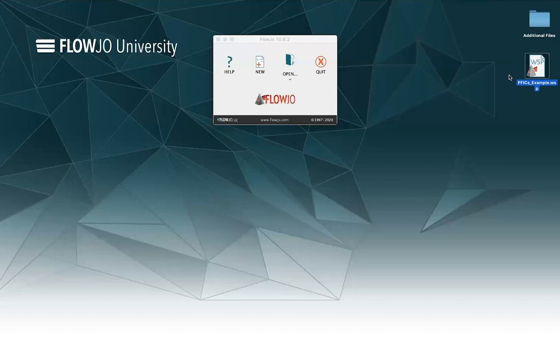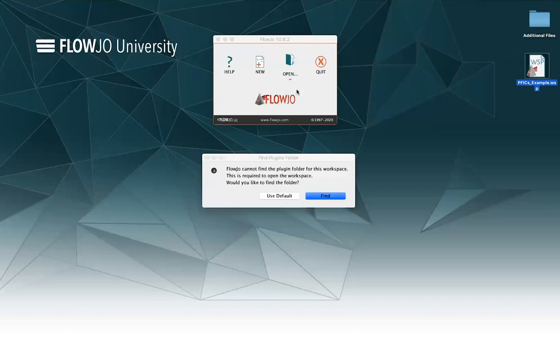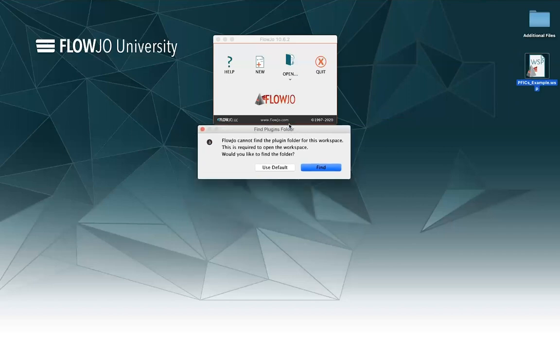This workspace has been disconnected from its folder. When I drag and drop the workspace here to open it, before it opens it tells me I have to find the plugins folder. What it means is not the plugins folder in my applications — it means I need to find the derived parameters folder, the folder that holds the analysis for my plugins and my T-SNE analysis for this workspace. So let me go ahead and hit Find.